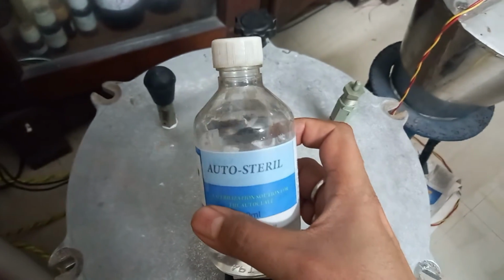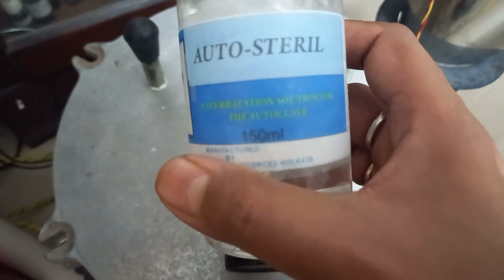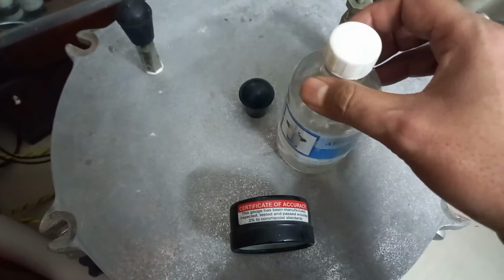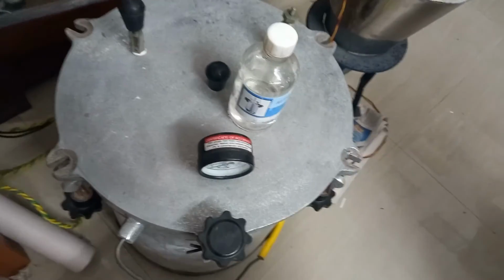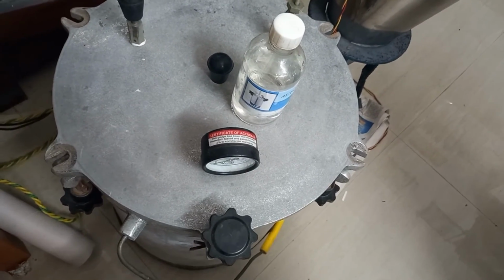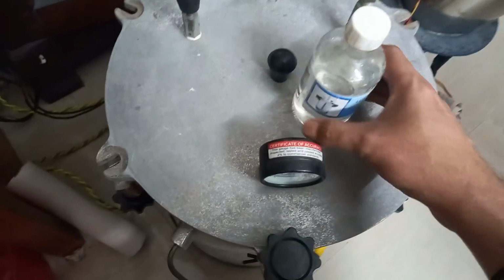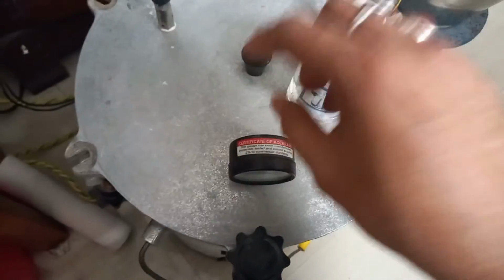This is an auto sterile. This solution I have named auto sterile. This is a sterilized solution, and it is made up of two reagents. One is isopropyl alcohol and the other one is glutaraldehyde. These two, 50-50%, you mix with distilled water.